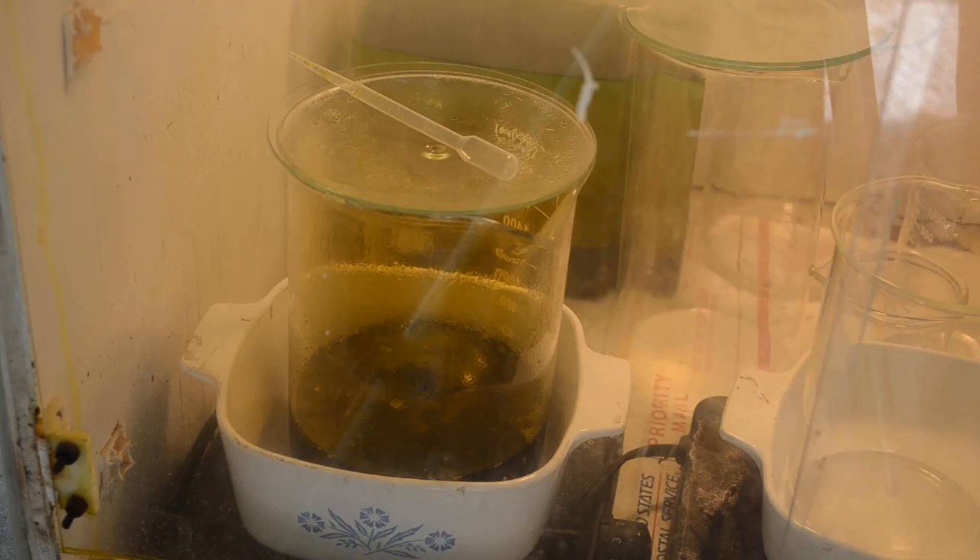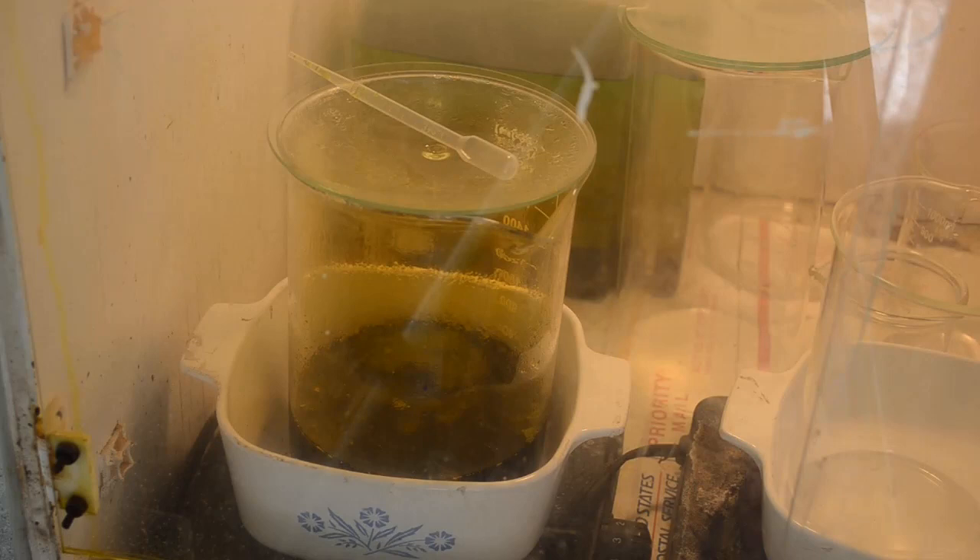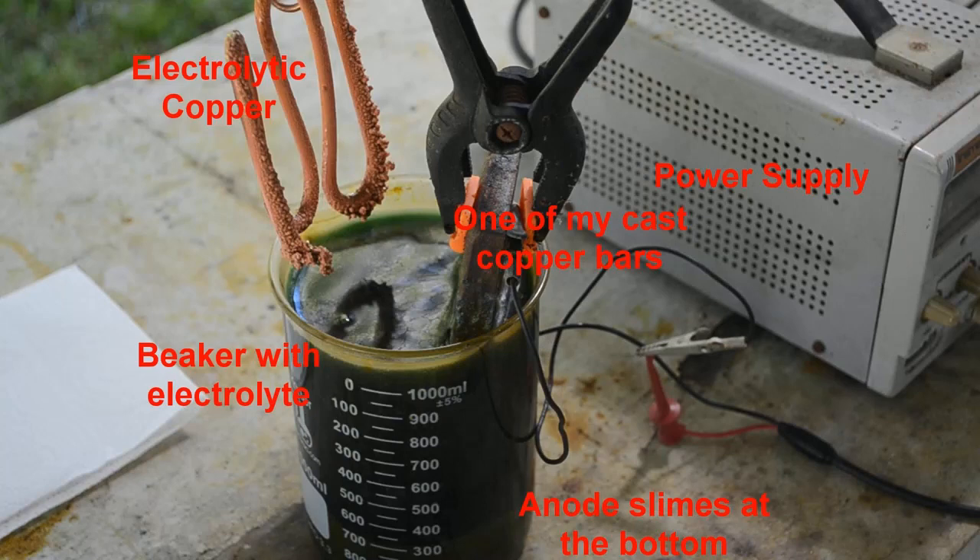Welcome back. A short time ago I released a video about processing the cement copper that I generate in my waste treatment system. I didn't know what to do with it — I'd been throwing it out for a long time and finally decided that was a big waste. So I started casting bars out of the cement copper, and then just out of curiosity I started doing electrolytic refining of some of those bars to get pure copper. In the bottom of the beaker I was using for my refining cell there were a lot of anode slimes, and I'll show you what I'm talking about.